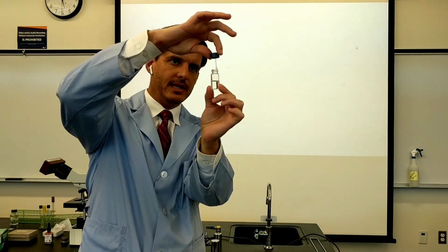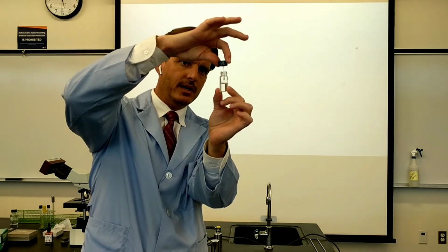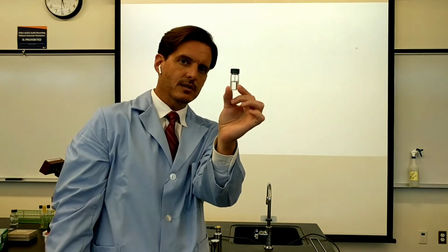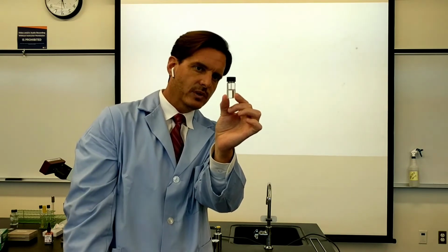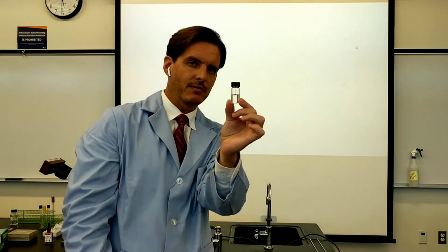And when I lift the glass rod out, we can see the glass rod. As the glass rod dips down into the oil, it starts to disappear. So the part of the glass rod that's inside of the oil really isn't able to be seen. And that's because it all has the same index of refraction.